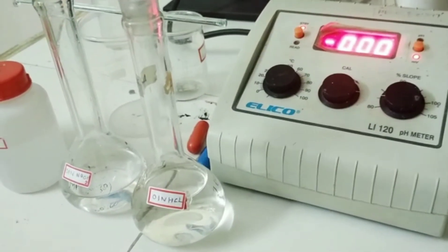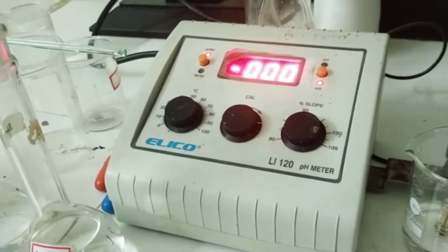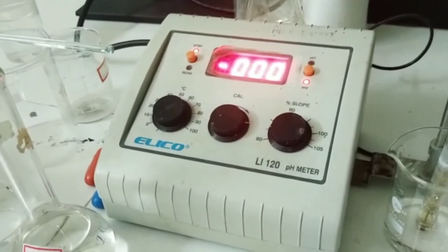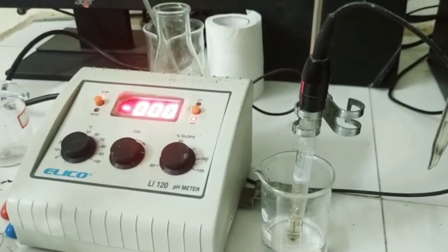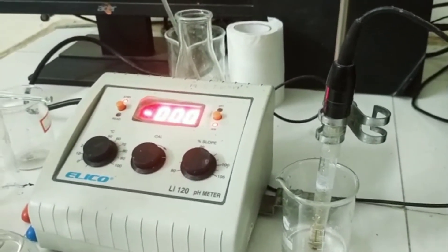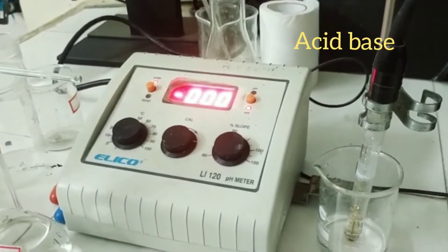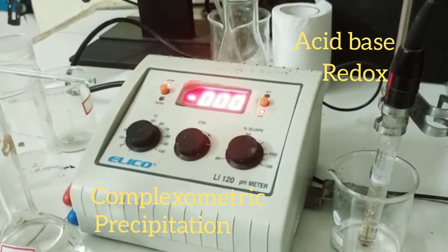Before starting the potentiometric titration, let me give you a brief idea about significance of potentiometric titrations. Titrations are basically laboratory methods to analyze the amount of analyte present in the given sample. There are different types of titrations based on the nature of the analyte like acid-base titrations, redox titrations, complexometric titrations, precipitation titrations, etc.